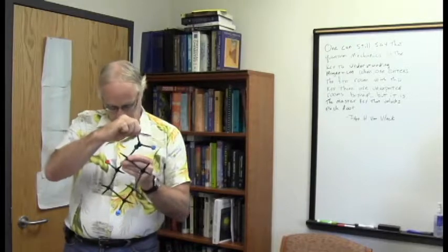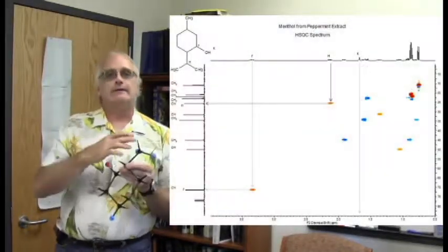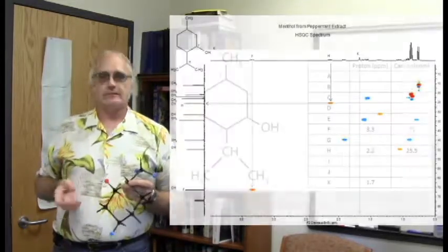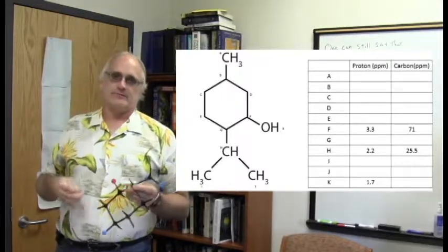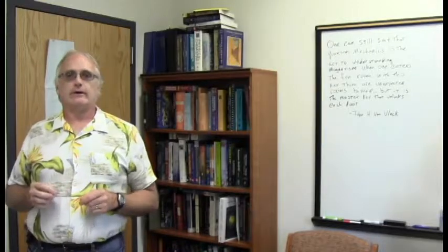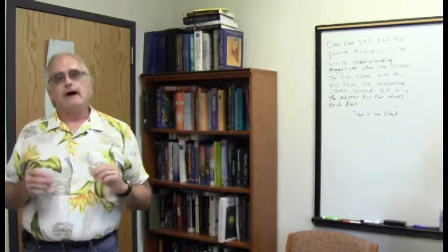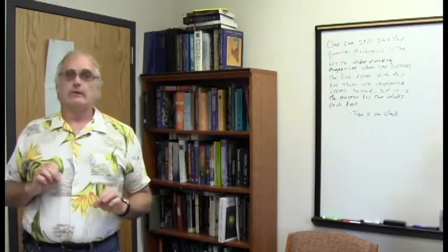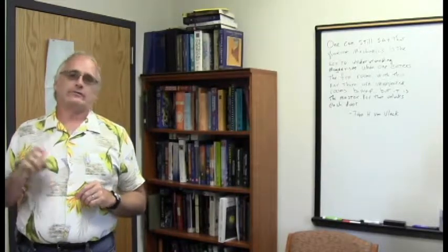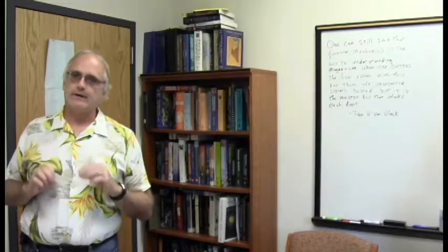But this one here will be proton H, a septet of doublets, and we can use the HSQC to tell us exactly which carbon it is at position H, and that allows us to fill in our table to this extent. And this covers the relatively obvious and fairly easy to get characterizations. One thing you're going to notice as we look at the next spectra is that with so much going on and so much to keep track of, every time I get a characterization I label it on my proton spectra, my carbon spectra, my HSQC, and even the COSY spectrum, which is going to make its debut now. When I know where position F is, I label it in all those spectra, and position H and position K. Again, there's just so much happening that it's really worth your time to be very systematic and very careful with this stuff.